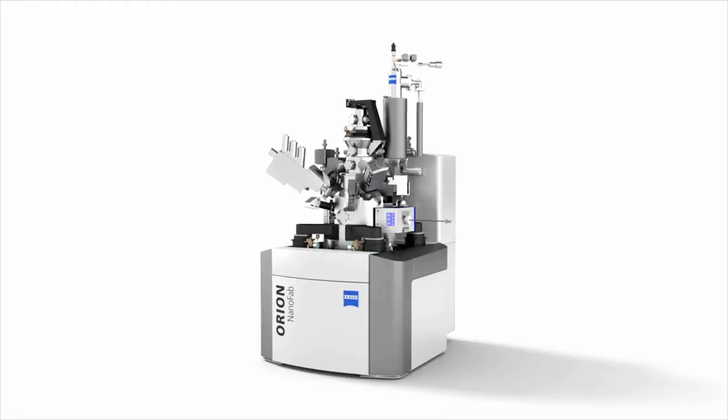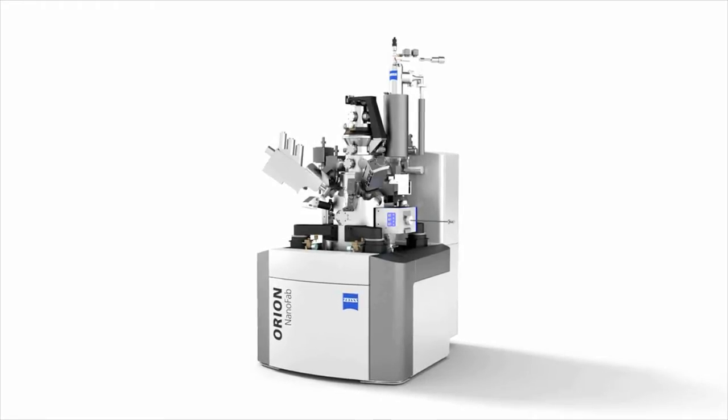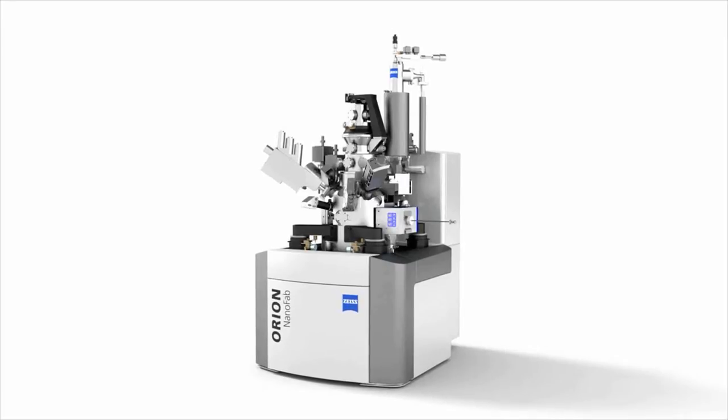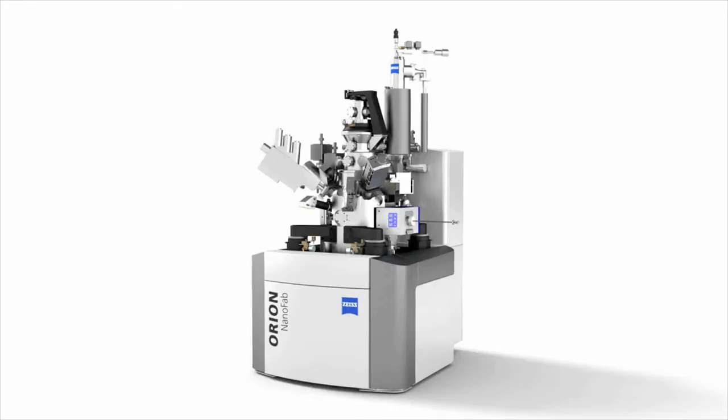If you're working in the micro electromechanical, the medical industry, the military, or the aerospace industry, nanofabrication is the technology of choice to process materials and devices and to increase the efficiency of your components.